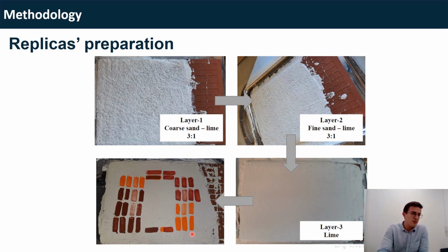Then we also tried some binary mixtures of compounds. And of course, we tried to have a whole hue, a whole palette from more intense colors to more pale colors. The objective was basically to build a calibration model which contained as much information as possible within it.